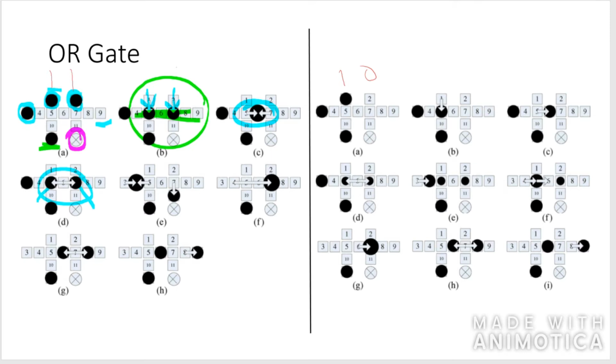So the second droplet, this one, is diverted into the waste reservoir because there only needs to be one droplet of a 1x volume in that channel at that time. So one of those droplets is combined with a reference droplet. That reference droplet is diverted down the channel. It's split again in the next step, and one of those droplets is put into the output, yielding an output of 1.